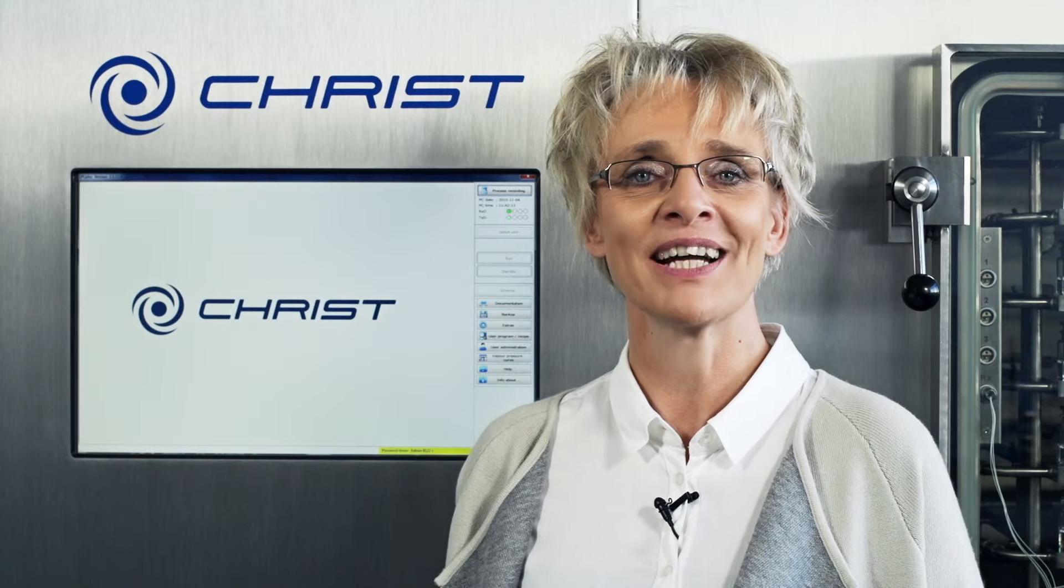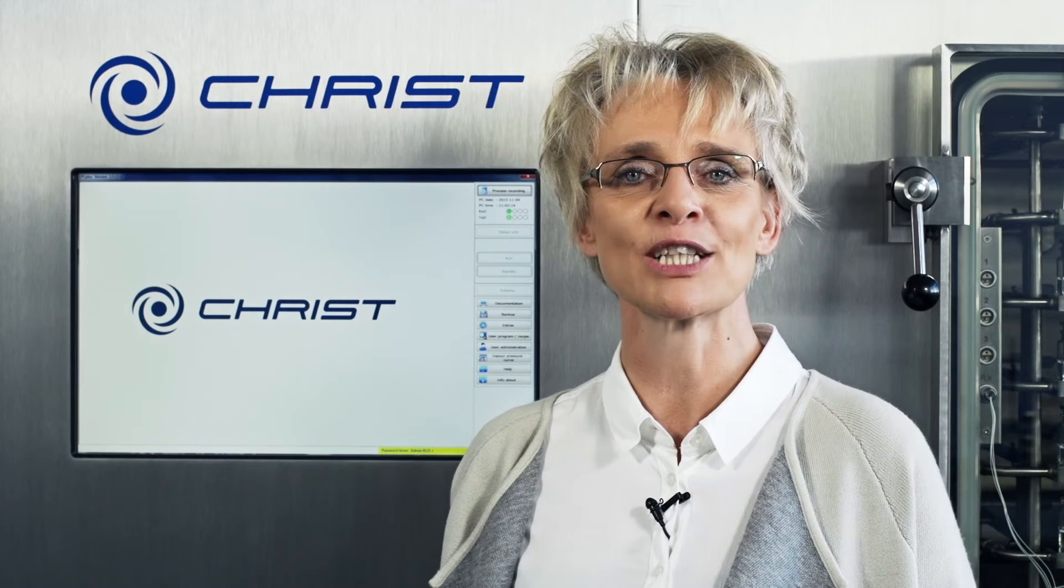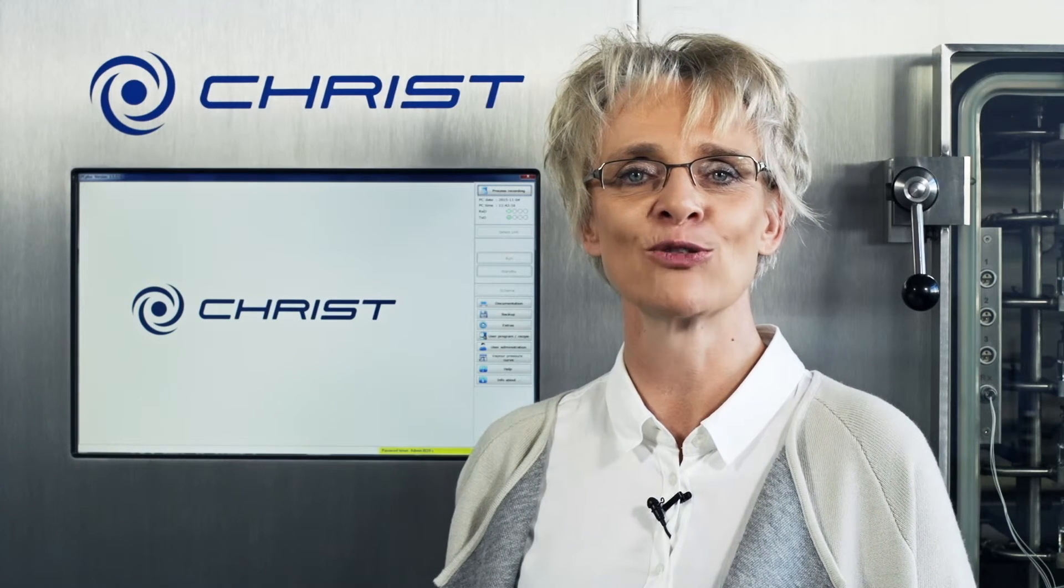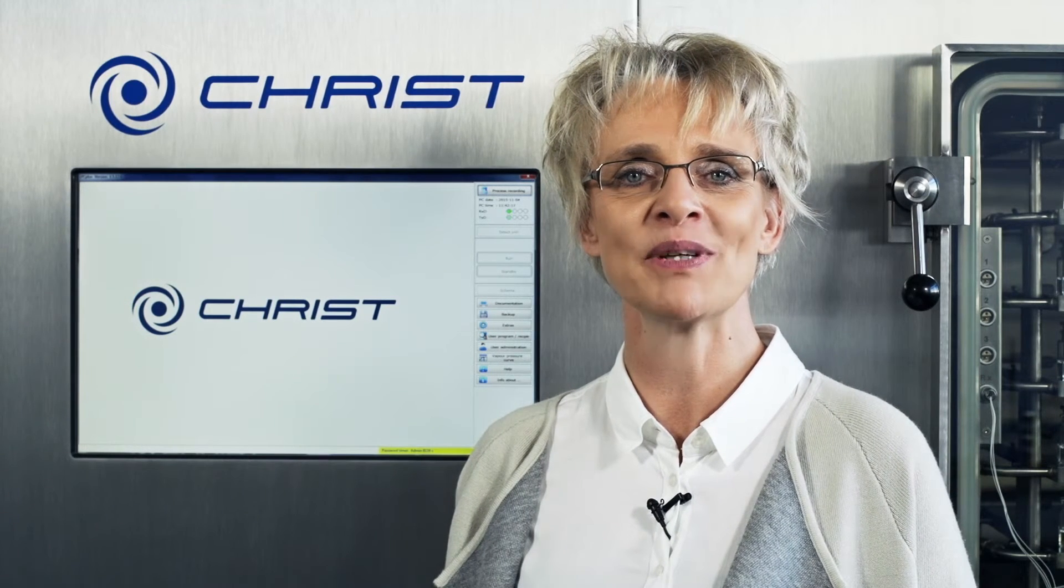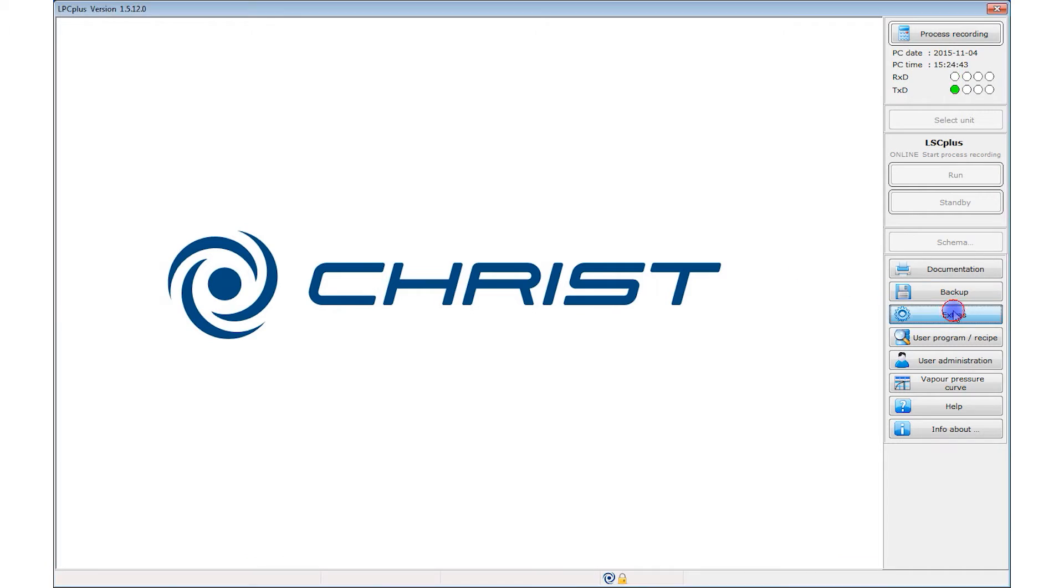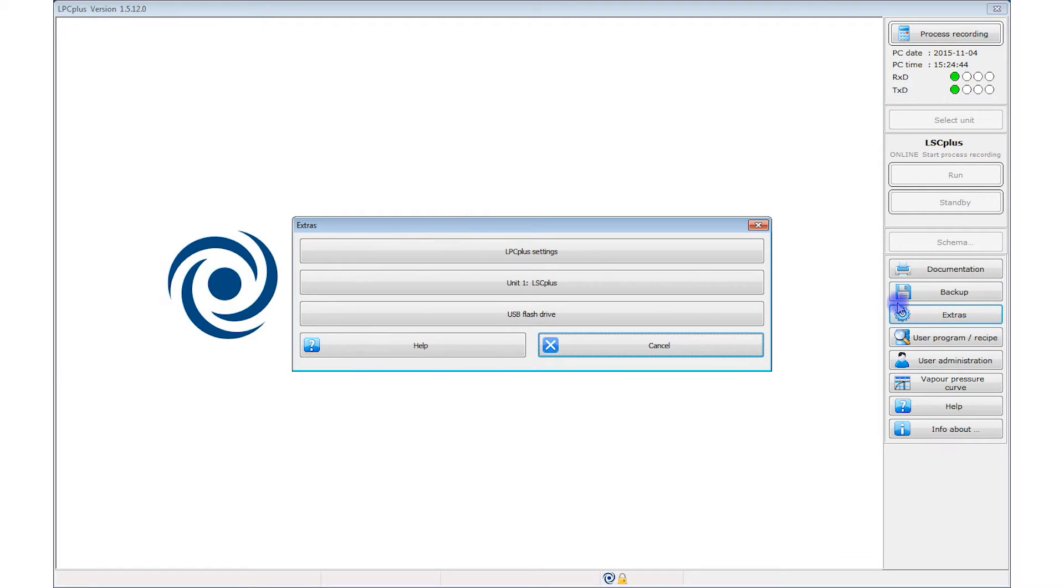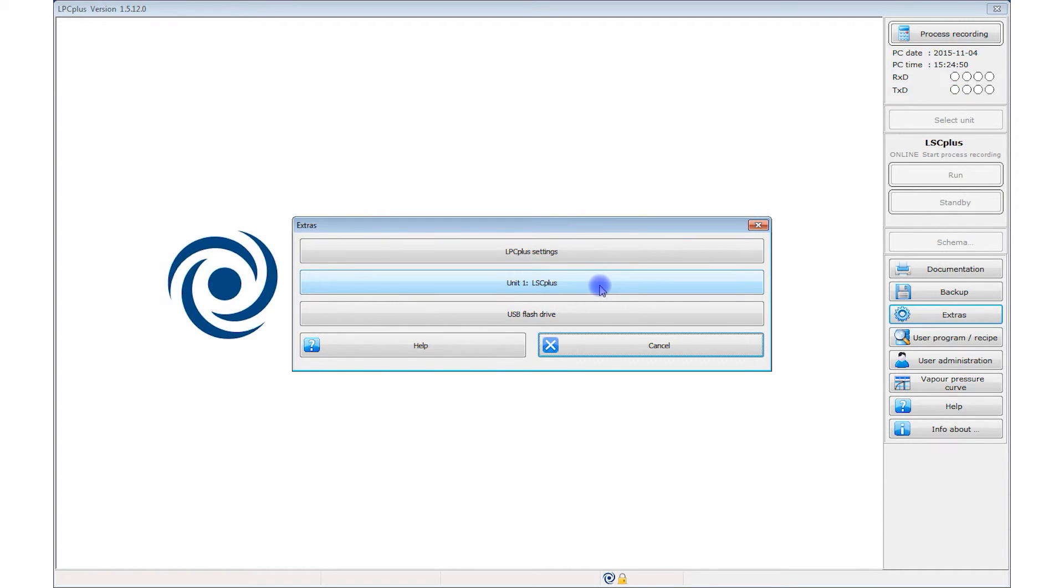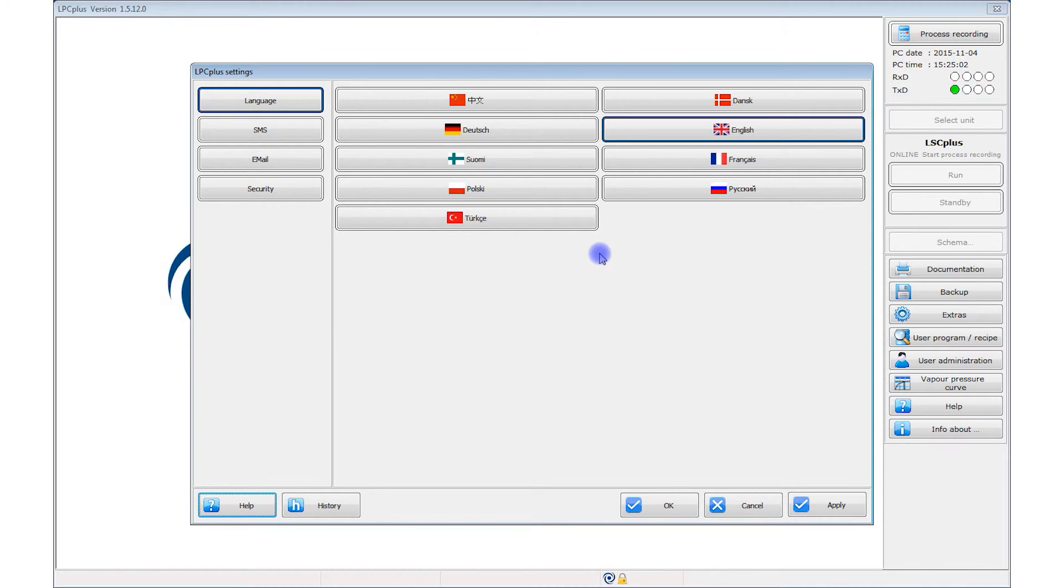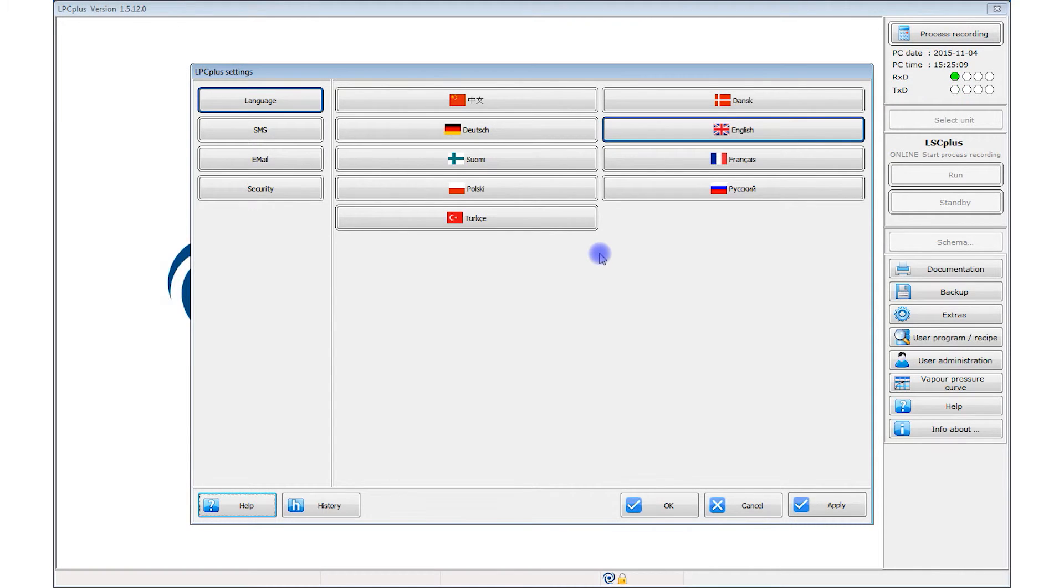There are also various basic settings that you can configure in LPC Plus. You access the program settings from the tools menu. Among other things, the LPC plus settings allow you to select the language for the user interface and documentation. A major advantage of LPC plus is that every process record is stored independent from the selected language of the user interface and can subsequently be displayed and output in every other integrated language.